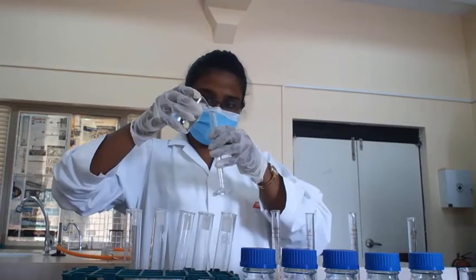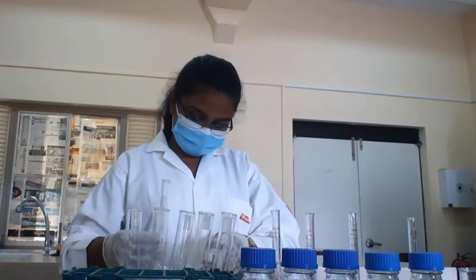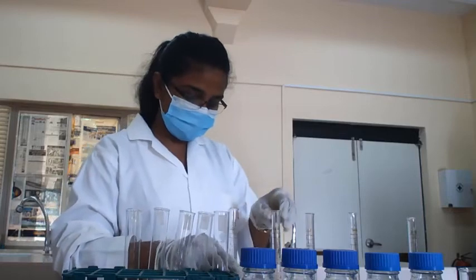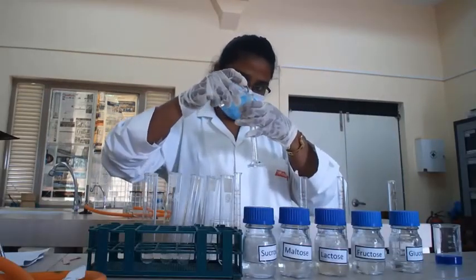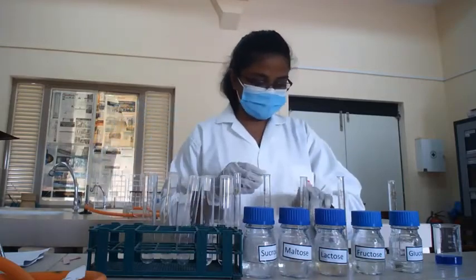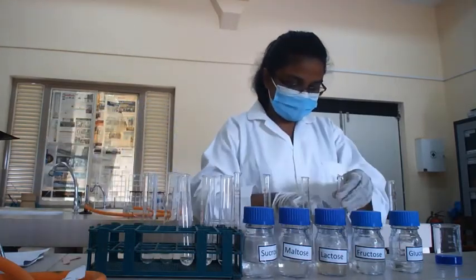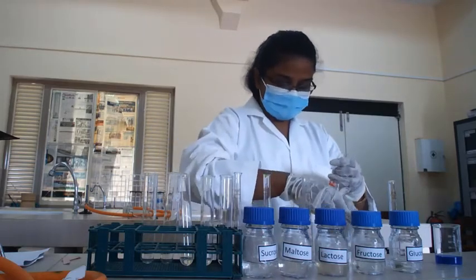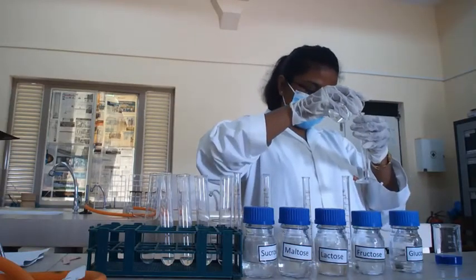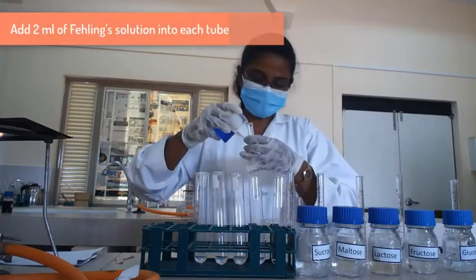Now we are going to measure 2 milliliters of each sugar solution. Then we have 2 milliliters of Fehling solution.